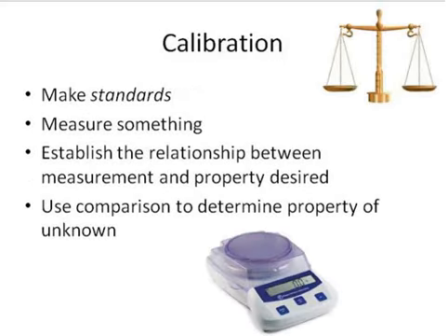So one of the key concepts of this experiment will be something called a calibration. And again, as I'm switching these slides, if you're not catching what I'm saying, remember that you've got the time bar at the bottom that you can use to go back to a particular slide and rehear the information that was presented on that slide. And the time bar has those vertical marks that show where I transition from one slide to the other.